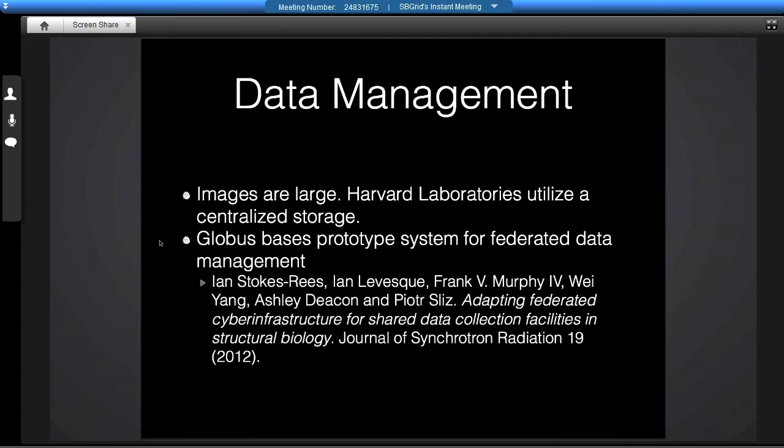And the community is still lacking, and as you know, PDB currently still doesn't take raw experimental data. I think we've calculated that for the entire PDB, 100,000 structures, if they had the raw experimental data deposited, it would fit on 3 or 4 hard drives.